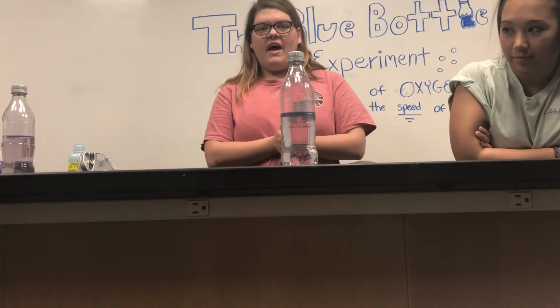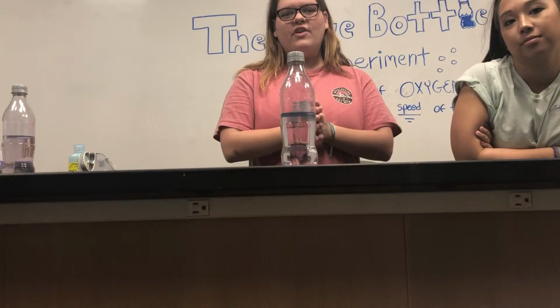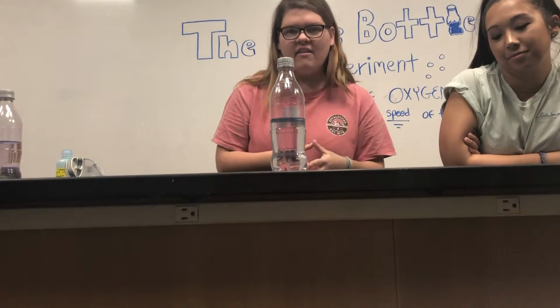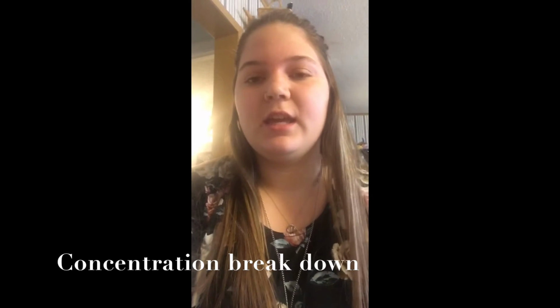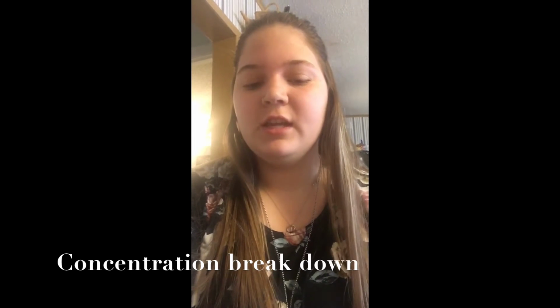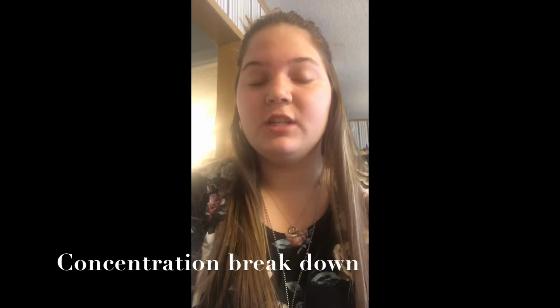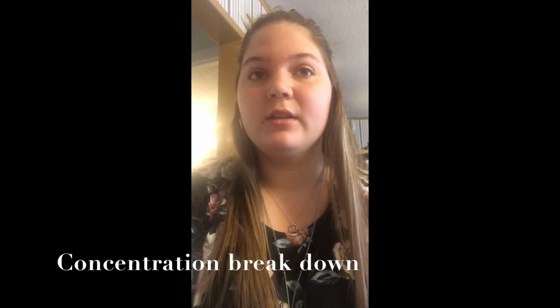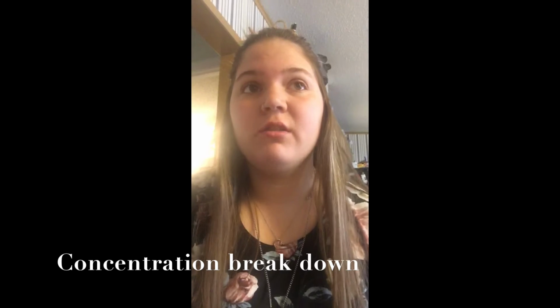And so that is the blue bottle experiment, showing the fading of methylene blue and how the concentration of oxygen affects the reaction rate. When looking at concentration compared to rate of reaction, we see that when you increase your concentration, the rate of reaction is increased also. This is because whenever you're increasing that concentration, it's giving you more of the reactants or ions in the reactant products. On the other hand, when your concentrations are already high, there's a limit where the concentration is so high that it'll change little to the rate of reaction.